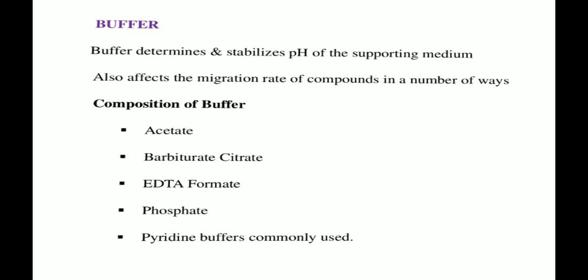It has been observed that zwitterionic buffers are able to withstand prolonged electrophoresis or electrolysis. They are much better in comparison to the traditional buffers, especially in one type of electrophoresis, that is capillary zone electrophoresis. Now, the composition of a buffer.